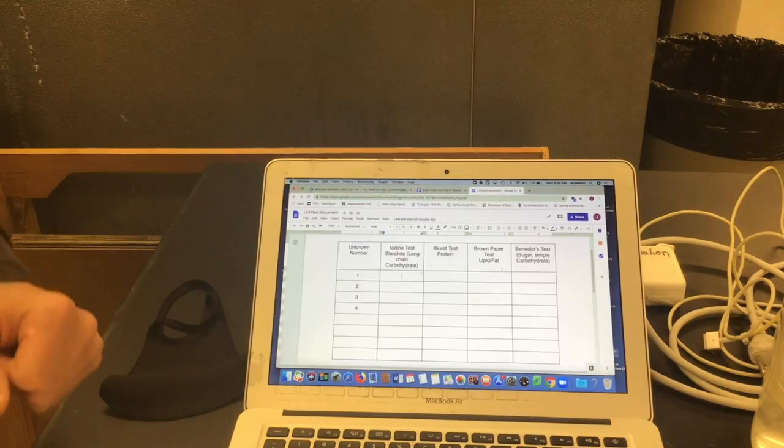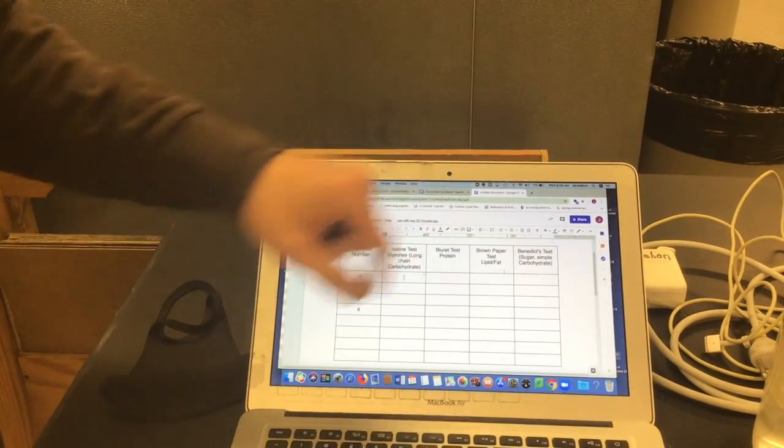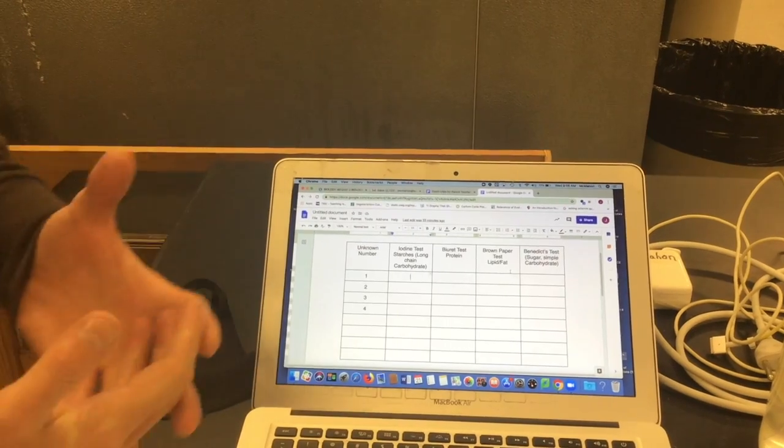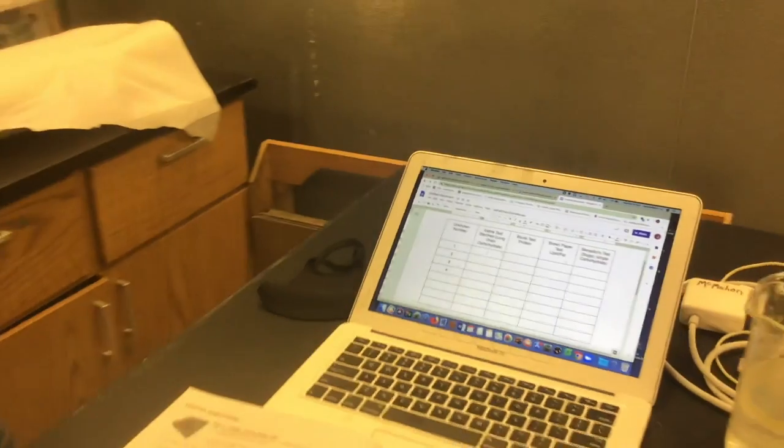So if you haven't done so, pause the video and go ahead and add in which macromolecule is being tested for based on the testing name.